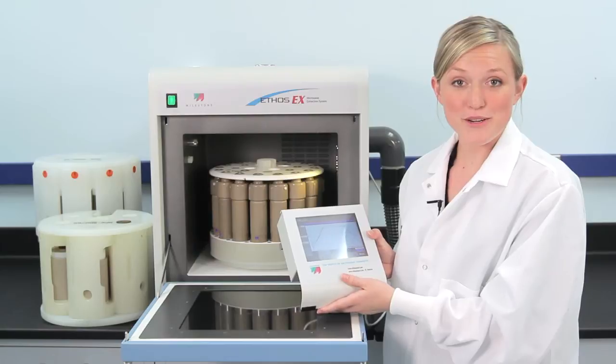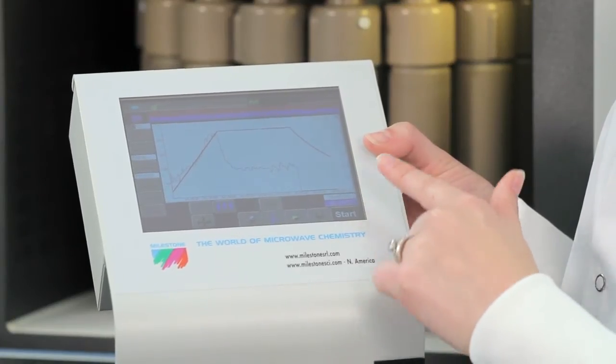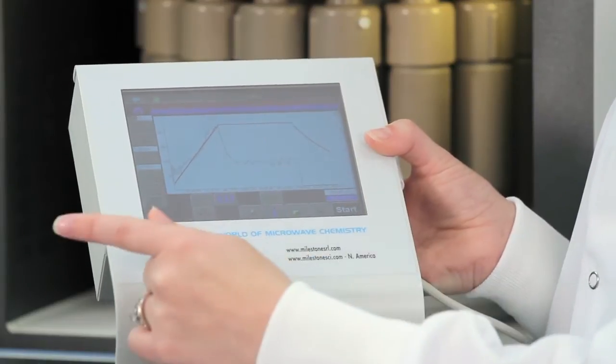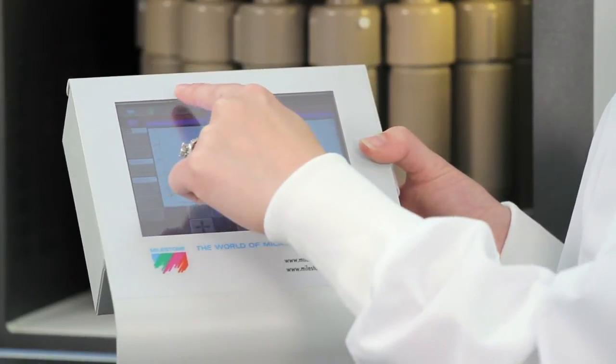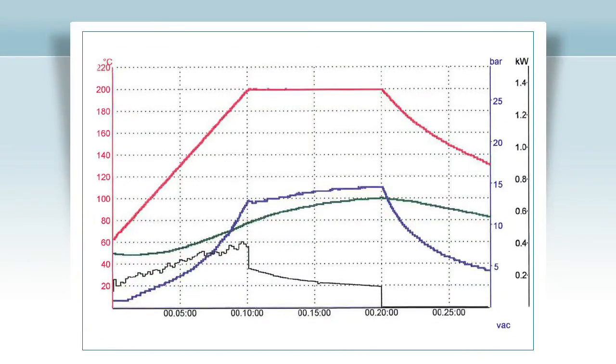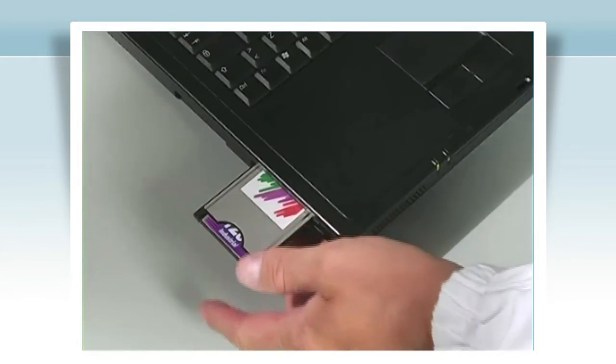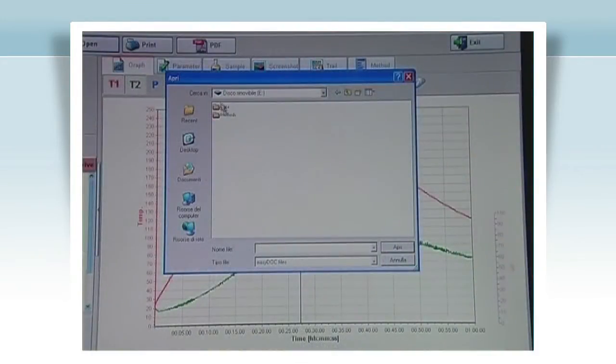Create a new program or simply recall a stored program and press start. When the microwave program is in progress, a real-time display showing actual temperature and power applied is shown. Easy Control software also automatically adjusts the power depending on how many samples are in the run. When the run is complete, it can be stored and recalled at any time. You can also connect a balance and directly input sample weights and store them with the run.